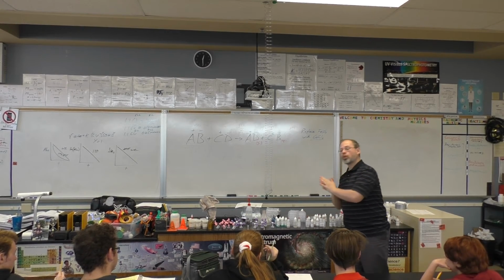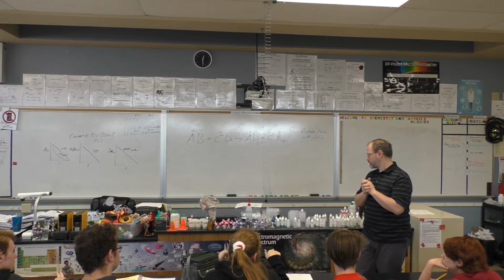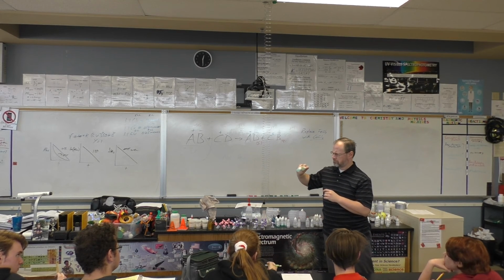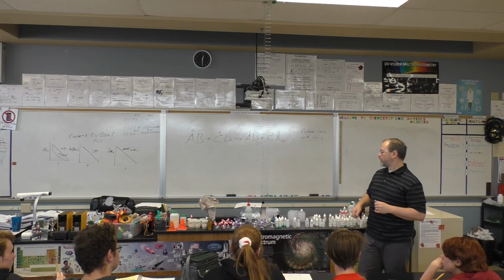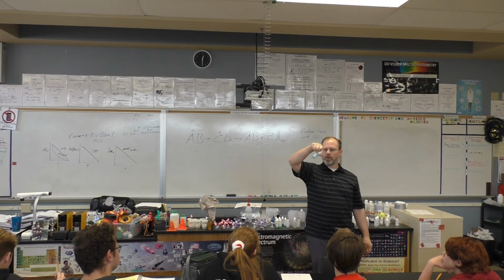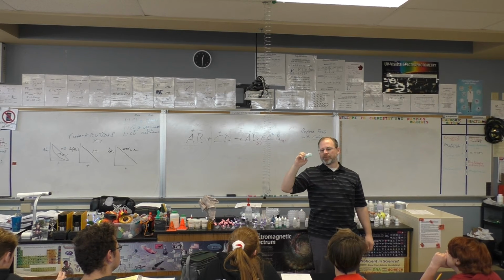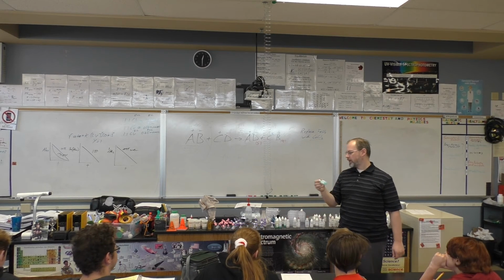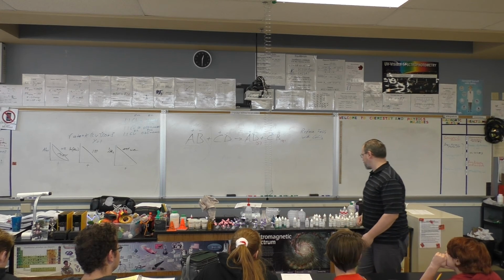All right. Questions? Yes. So that means the ones that are colors that are up there. I'm not sure what you mean. Like, the ones that have different colors. You can absolutely use them. Oh, like copper sulfate, it's blue, but you can see right through it. When you make a precipitate, it's going to go cloudy blue, or it might turn green or brown or red or purple or something. I can tell this one already needs to be thrown away because it has little pieces in there already. Oh well, such as public education.